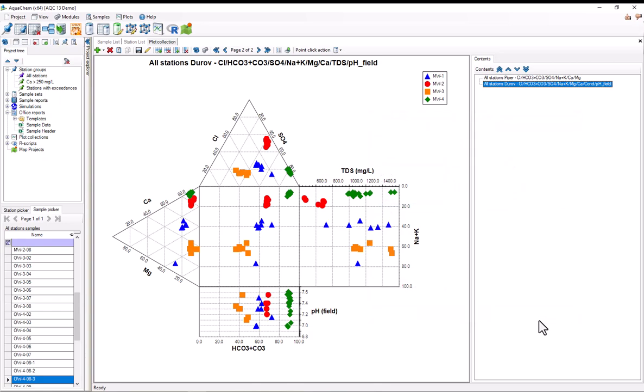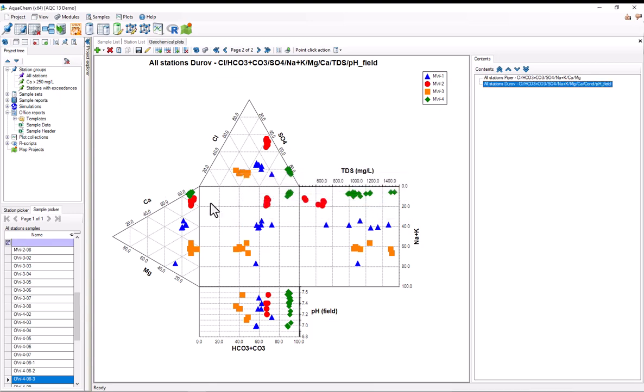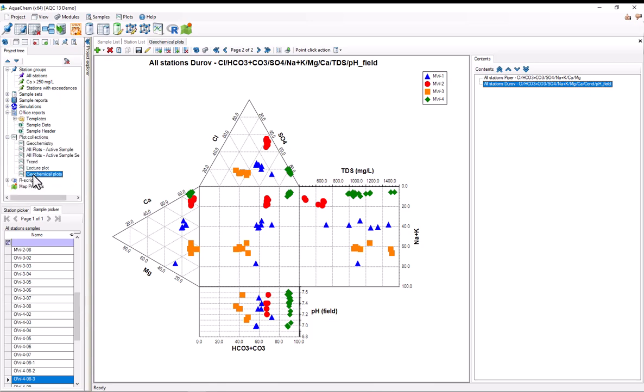I'll close the options. Finally, if I wanted to save these plots for further use in AquaChem, I could simply save the plot collection by pressing the Save button in the Geochemical Plots, and press OK. And now, if I look in the project tree under Plot Collections, you can see that this plot collection has been added.